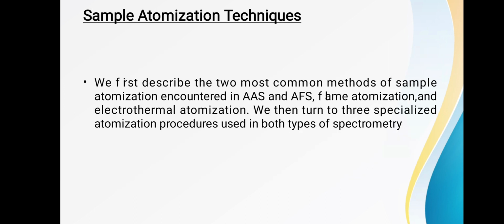Sample atomization techniques. We first describe the two most common methods of sample atomization encountered in AAS and AFS: flame atomization and electrothermal atomization. We then turn to three specialized atomization procedures used in both types of spectroscopy.